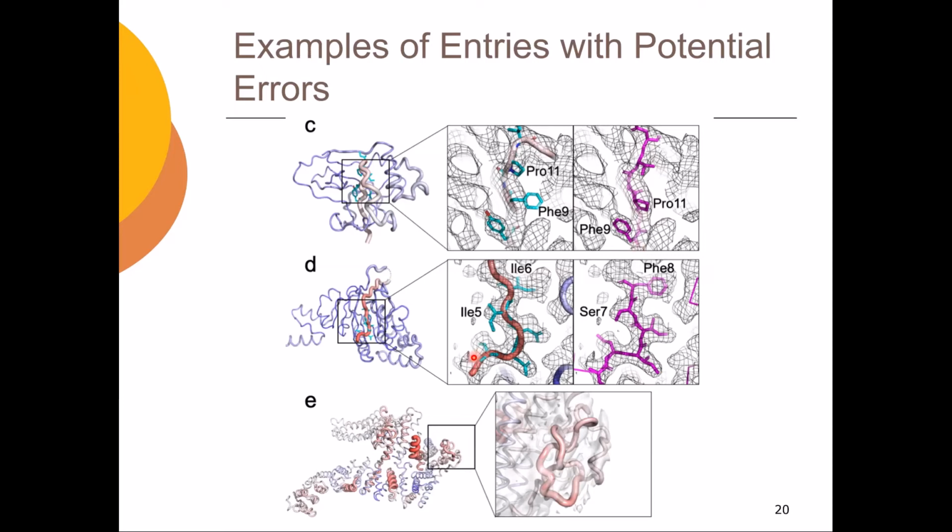This is basically the same story. There are 2 isoleucines facing outside to the solvent, which is probably not usual. But if you check the AlphaFold model, then it fits nicely. The side chain fits better to this density. And as you see here, again, this is a residue shift. There are some extreme examples like here, which have chain entanglement in the model.